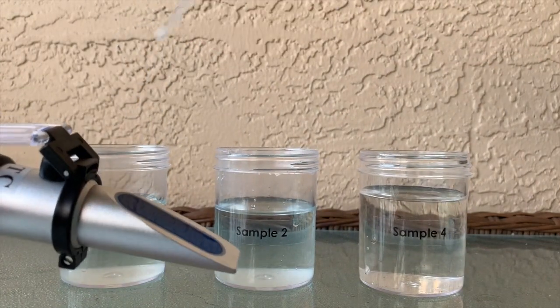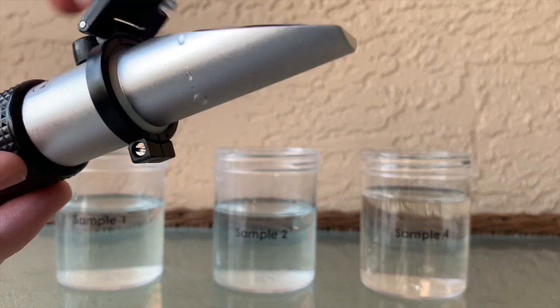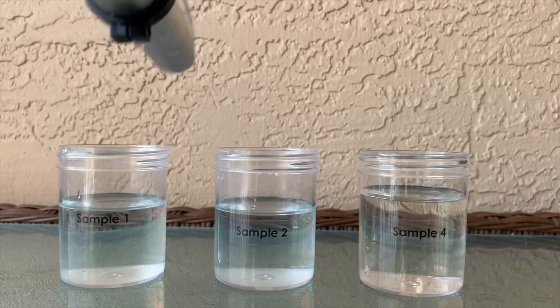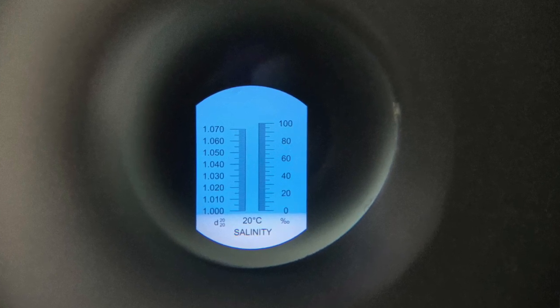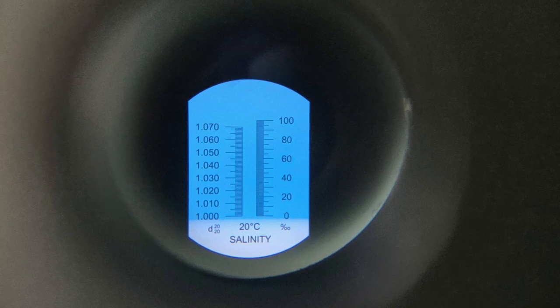For our first sample, we're going to go ahead and put a little bit of water onto our refractometer, close our lid so we can observe, and take a look inside. As you can see for sample one, our blue line did not really move from the bottom, so most likely this is going to be a fresh water sample.